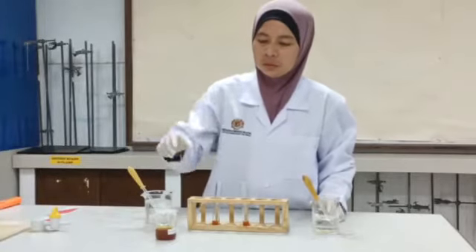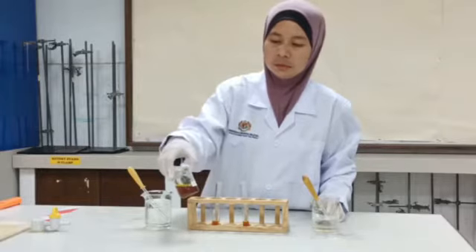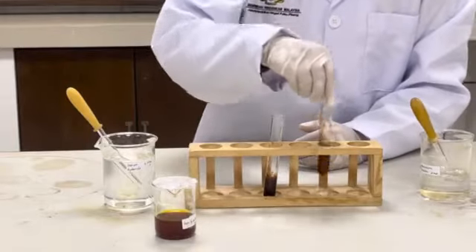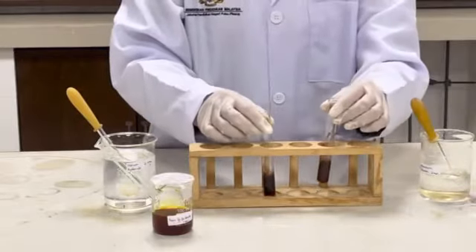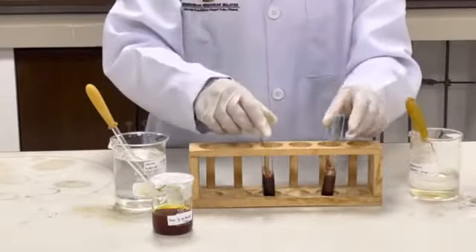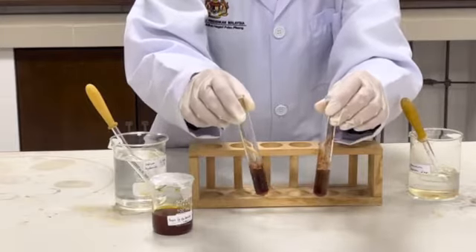Now test for iron(III) chloride solution, which means the ion is iron(III), Fe³⁺. Here we have 2 cm³ of iron(III). For iron(III) chloride, when you test with excess sodium hydroxide and excess ammonia solution, you will get a brown insoluble precipitate formed for both.